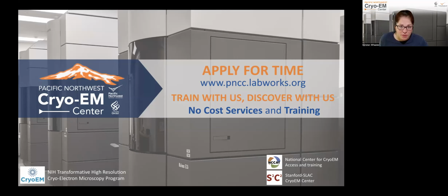Our screening access proposals allow up to 2 people to come on site and prepare their samples and get those ready for additional processing of information that they need. General access proposals are open to data processing as well as screening services, and that is awarded 480 hours of microscope time for 2 years each year.